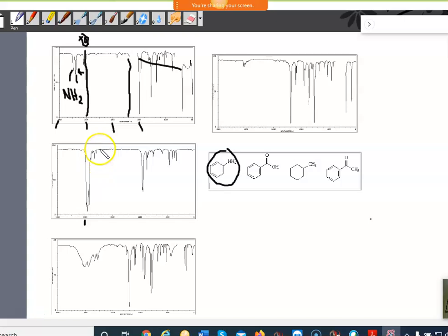This stuff looks like junk to me, but you might be thinking, well, maybe it's an aldehyde. Here's one of the peaks, here's the other, it's kind of too far away. If you're squinting at it, not too sure, you look for the carbonyl. If you do think it's an aldehyde, you would expect to see a carbonyl around here, and I don't. So I know it can't be that, it's probably just junk. So this basically just says I have aliphatic on a molecule, so that would represent this molecule right there.